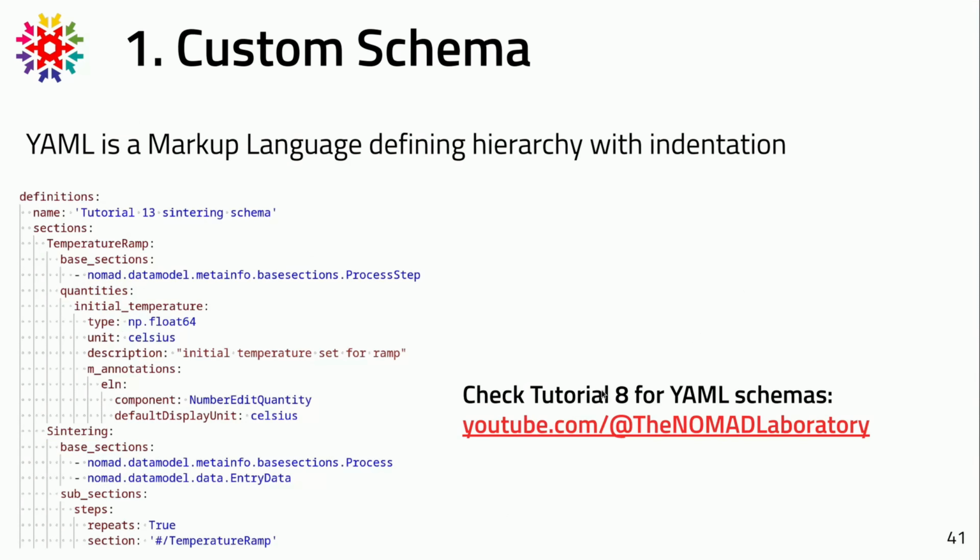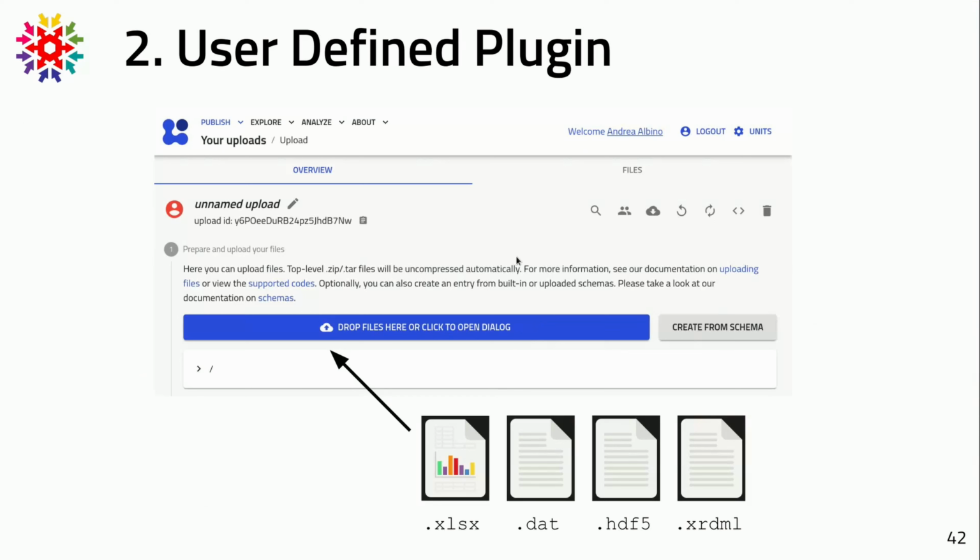For a better understanding of this, you can also check out tutorial 8 on the YouTube channel, where we go into more detail in the explanation of how to build such YAML schema files.